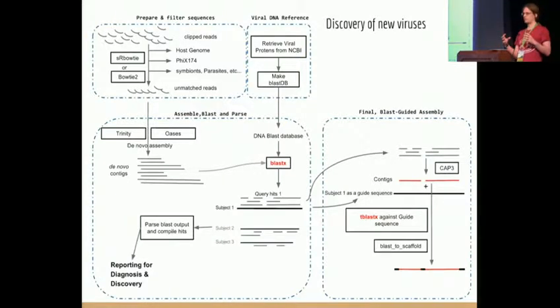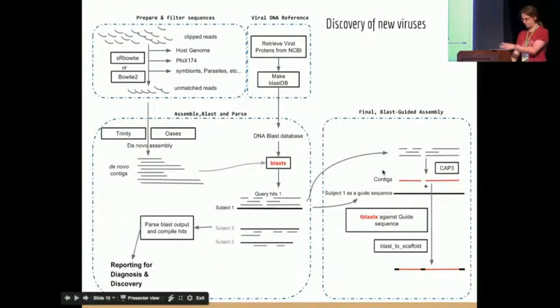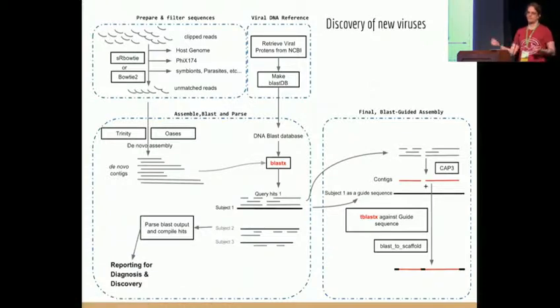You can look at those that had not been identified with BLASTN, and then go a bit further in the distance. And again, you can use the same steps of the workflow to get your new sequence back. You can fill it in, and use that to design primers and to confirm that what you found is really present and not just an assembly artifact.